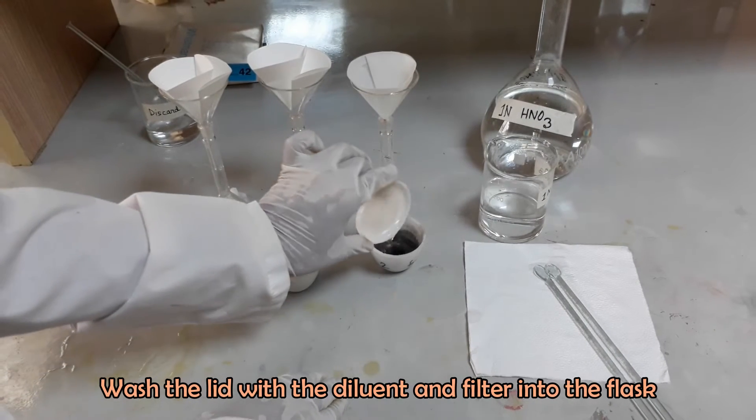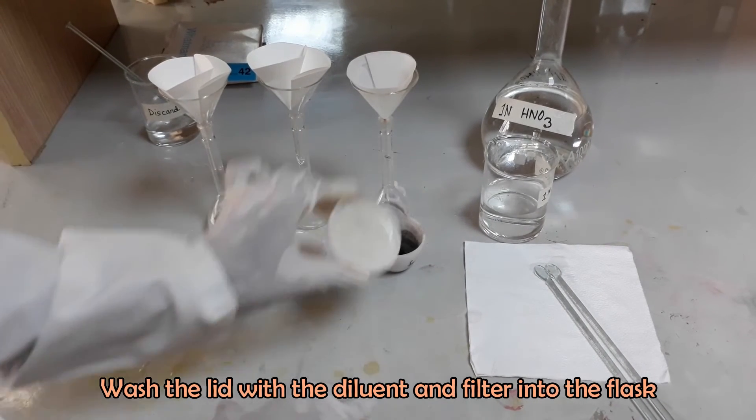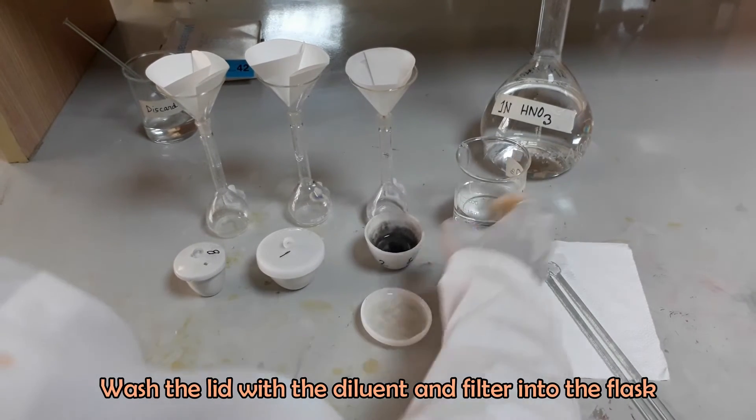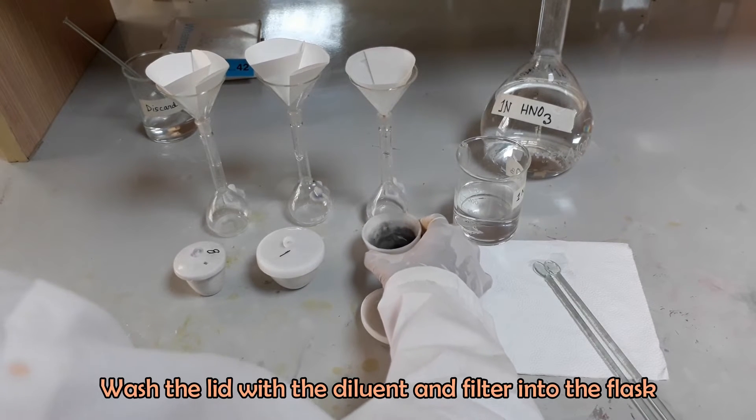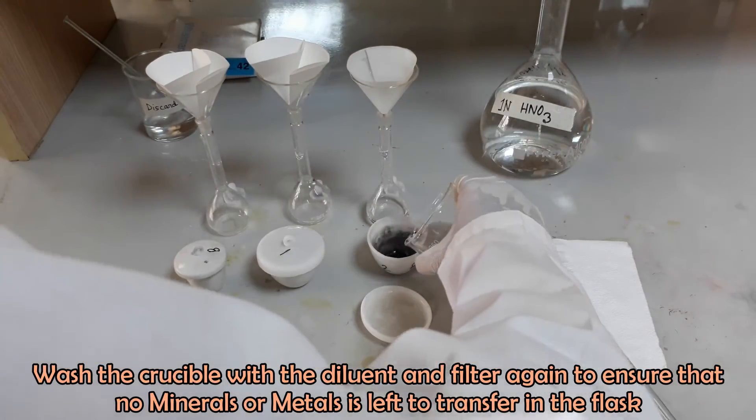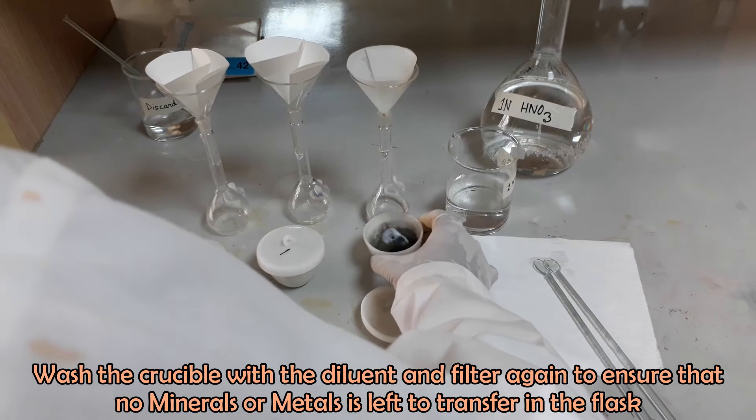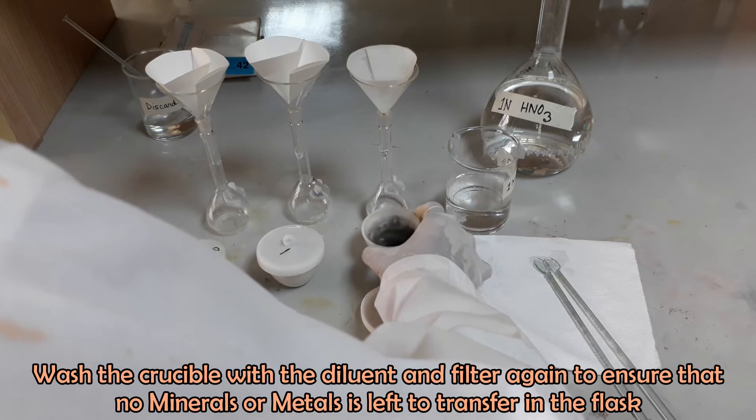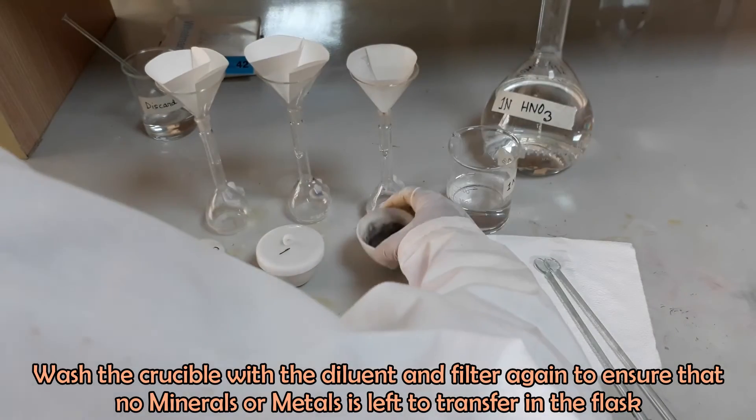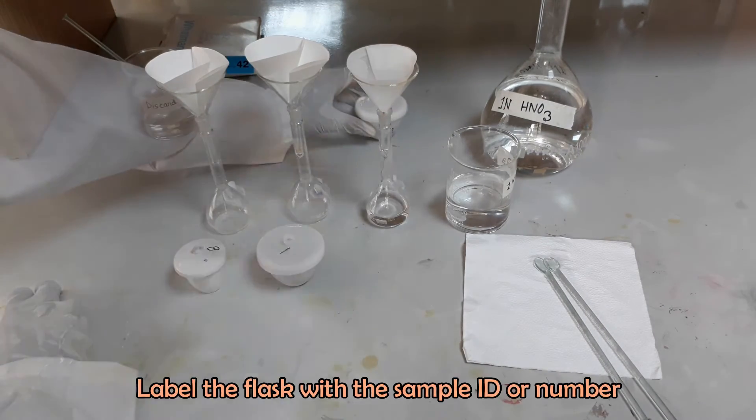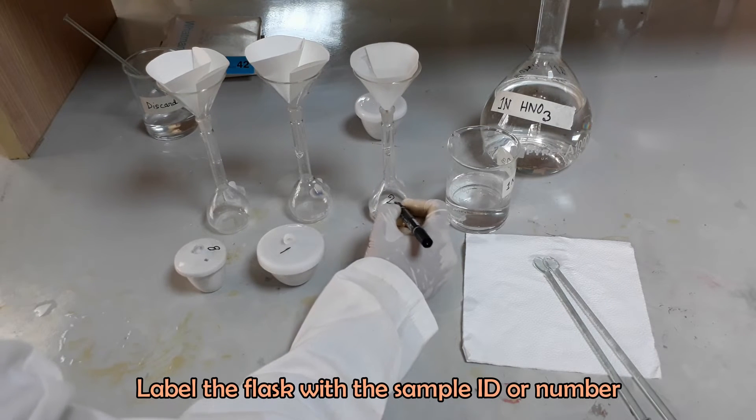Wash the lid with the diluent and filter into the flask. Add the diluent and filter again to ensure that no minerals or metals is left to transfer in the flask. Label the flask with the sample ID.